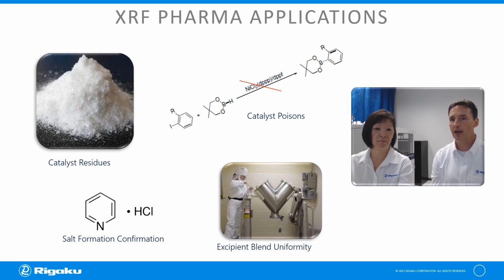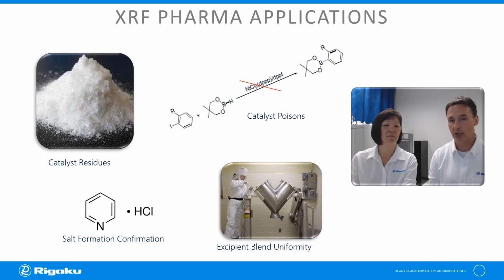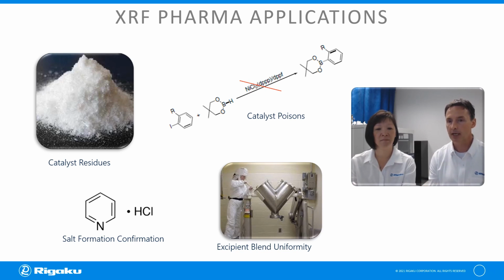Okay, so there are a lot of applications in the pharmaceutical industry where XRF has a place. It has not been widely adopted. It's just that the education for what's available, or really understanding, because there's such a wide variety of instruments that Thanh will talk about in a second, it hasn't been adopted. So what we're doing is trying to help educate, and we have several sessions here.